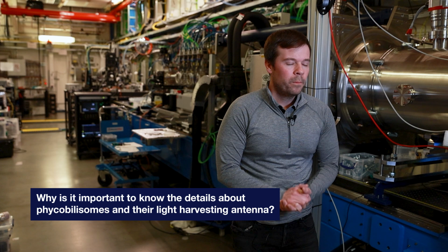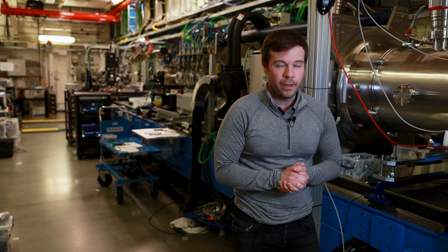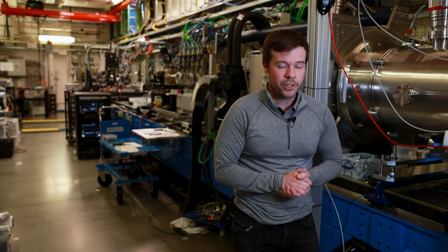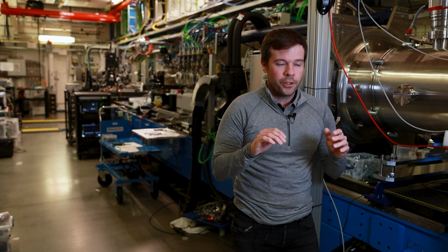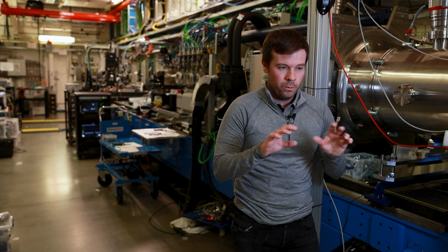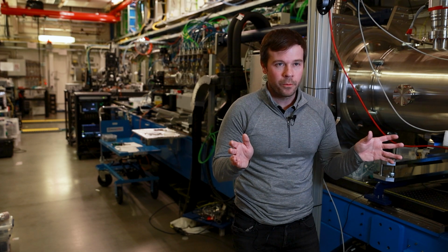So recently there was a cryo-EM study on this same phycobilisome light harvesting antenna, and they found that what was originally thought to be one single structure was actually a mixture of three separate conformations.